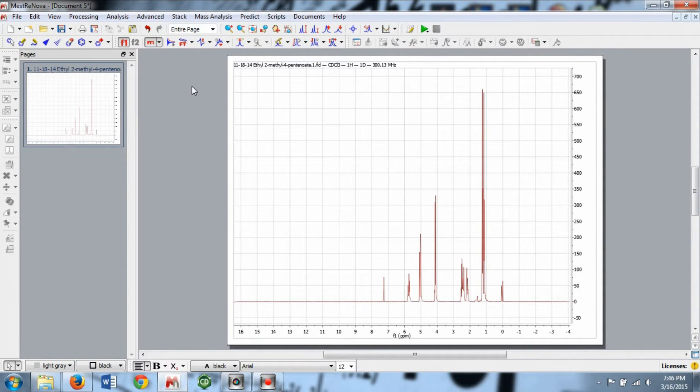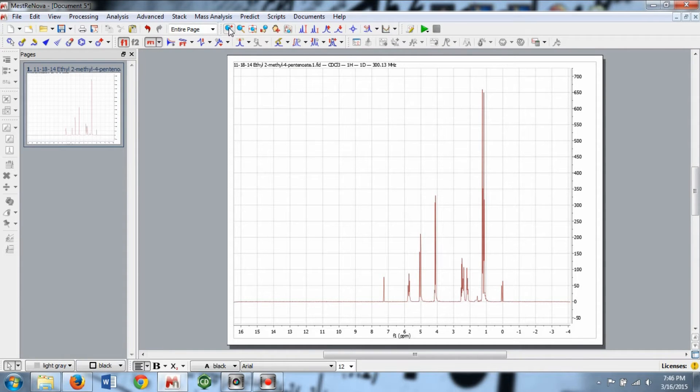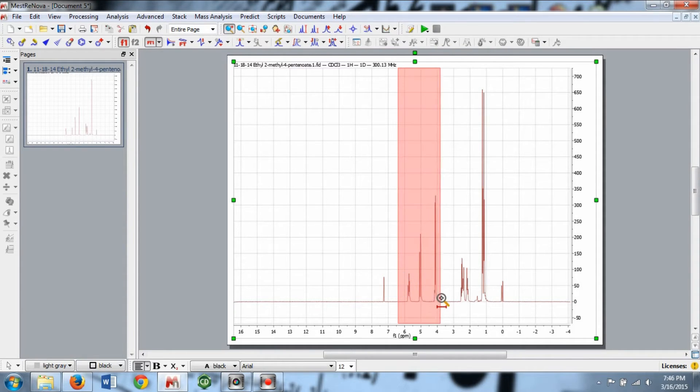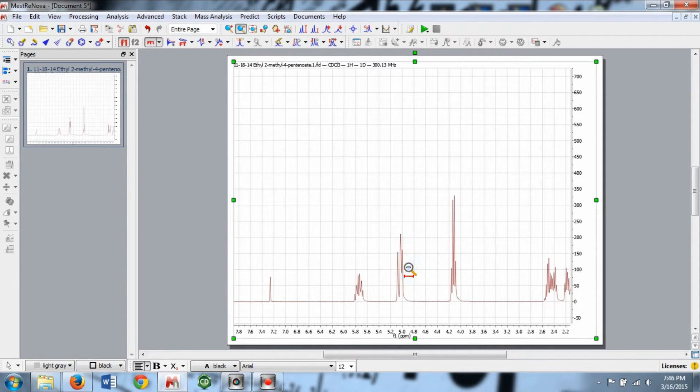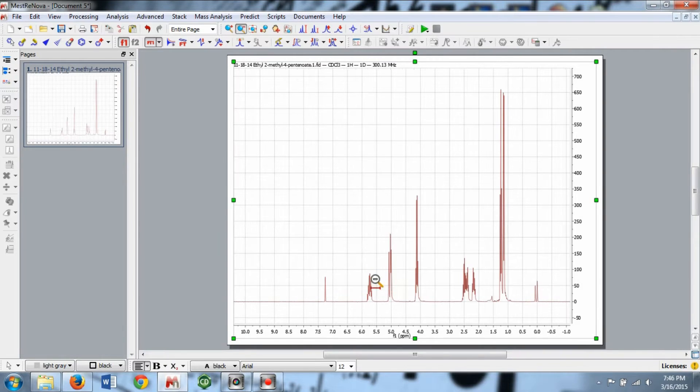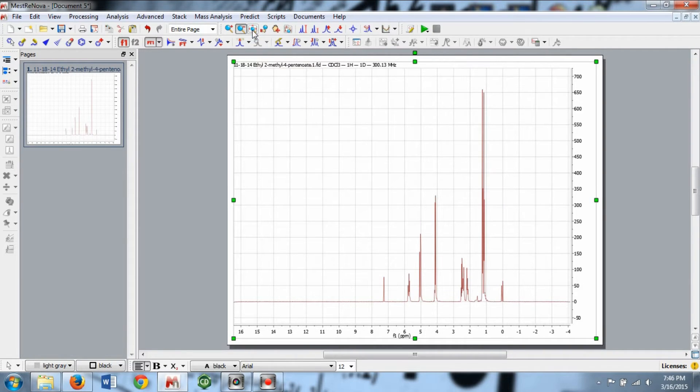To zoom in on a region of the X-axis, left-click the plus magnifying glass, and then left-click and drag on the spectrum where you want to zoom. To zoom out, select the minus magnifying glass and left-click on the spectrum, or click the Full Spectrum button. To deselect a command, hit the ESC key.